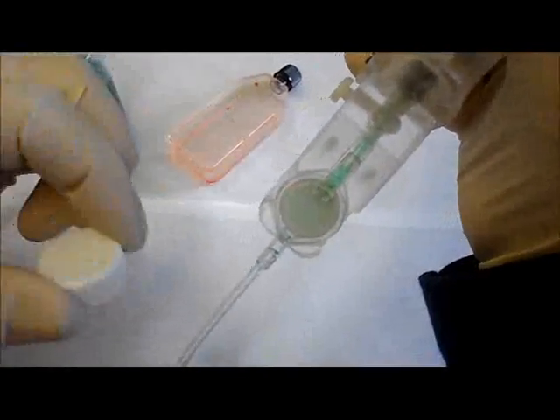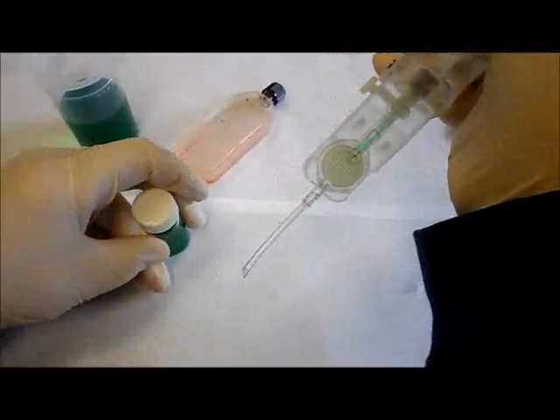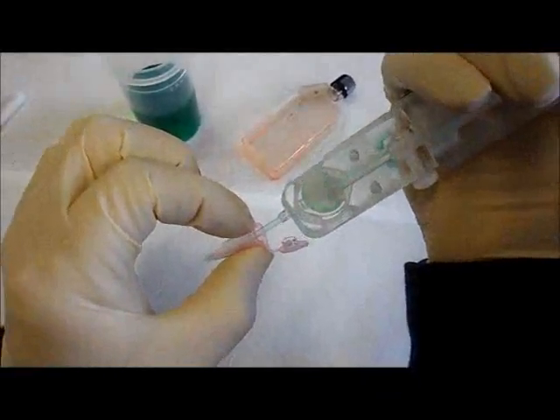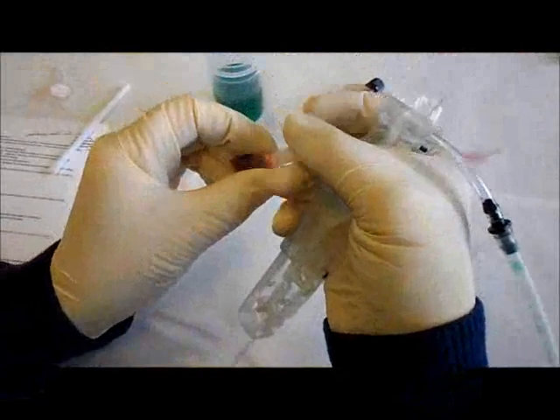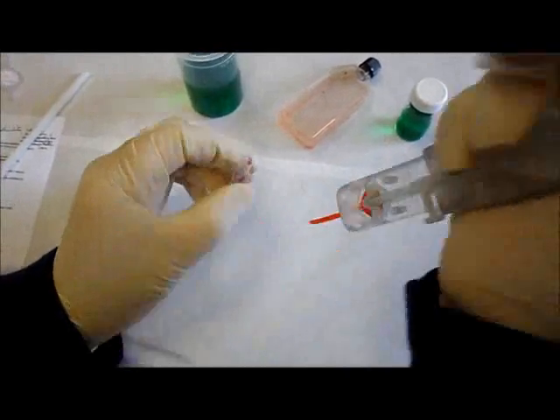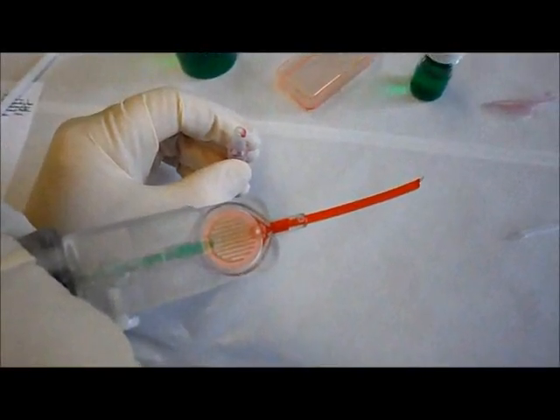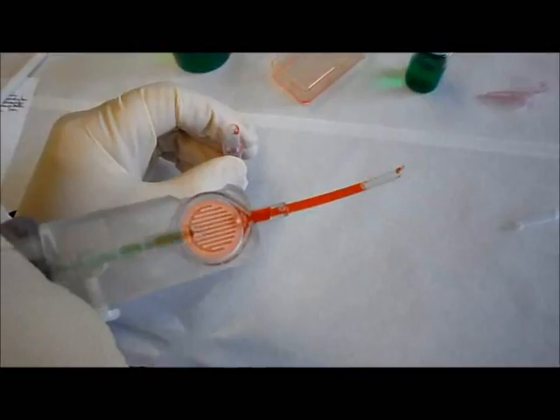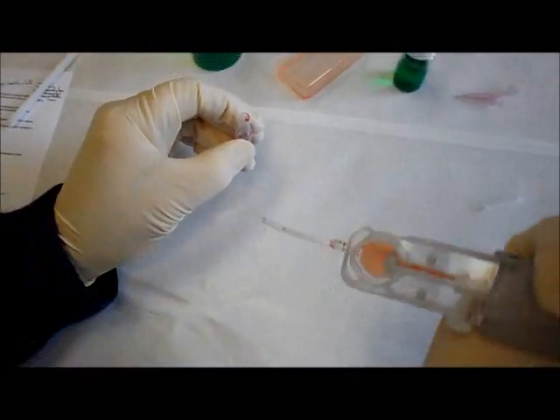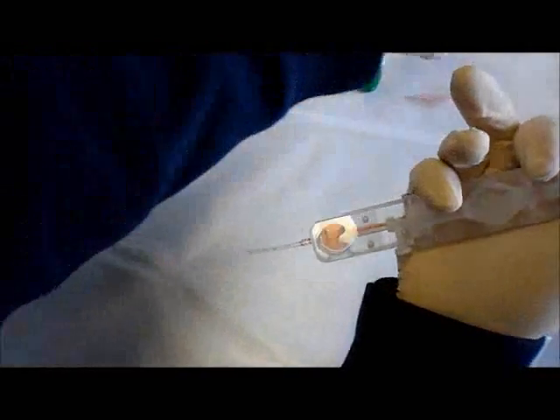You can see on the back side of it there's just a green color of the filtered material, that's on the exit side. The process we can use with these various tubes and attachments, we can reach down into this small microfuge tube and I can reach in there and pull out the sample. Or let's say that this was now ready for bacterial culture and then I want to do an assay with it. I have some culture media. I've got an ampoule here and I can go in and fill this cartridge up with media. If I show you the back side of it, it's still got the green from the original rinse, and I can pull my media through and purge out all of the previous sample material that was within the cartridge.